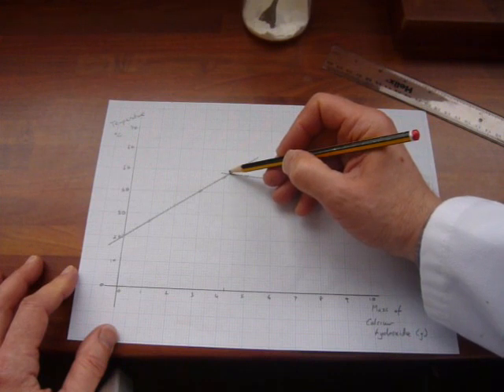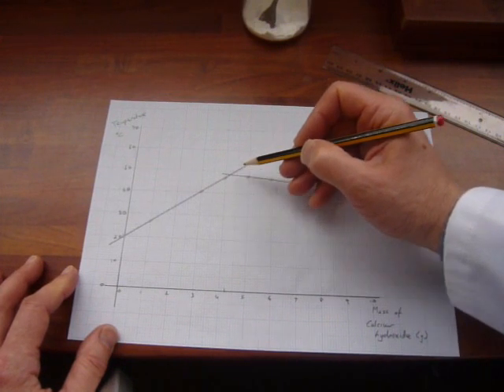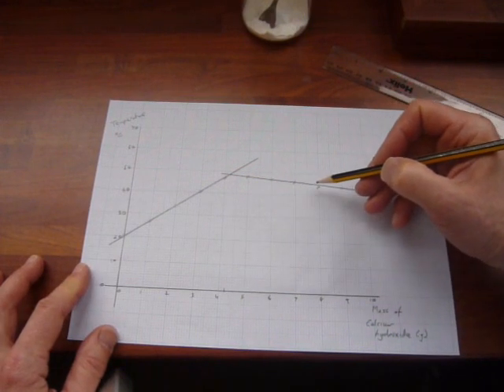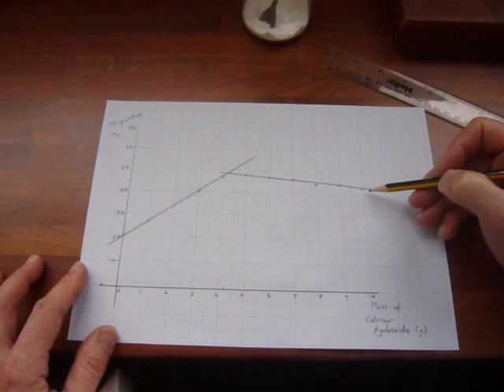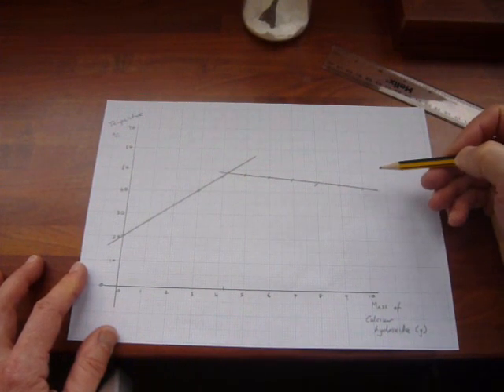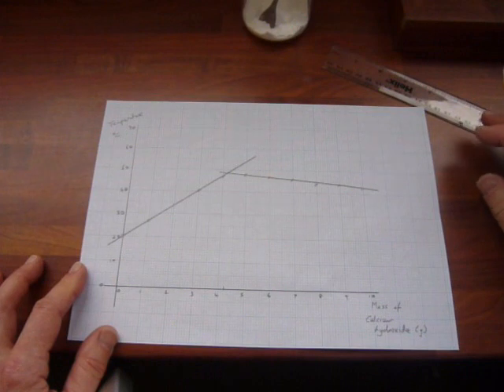This gave off the most heat energy, so the temperature rise was highest. Above that point, all we're doing is adding extra calcium hydroxide that has nothing to react with. And because it's got nothing to react with, it's not going to raise the temperature of the reaction mixture.